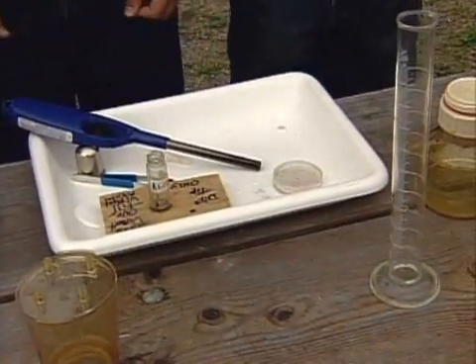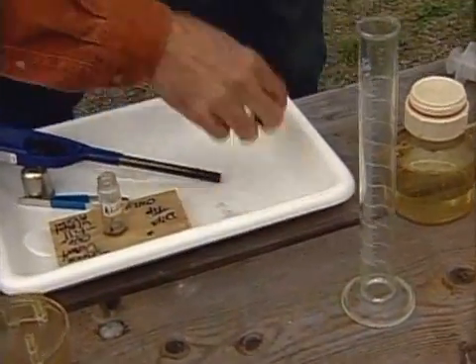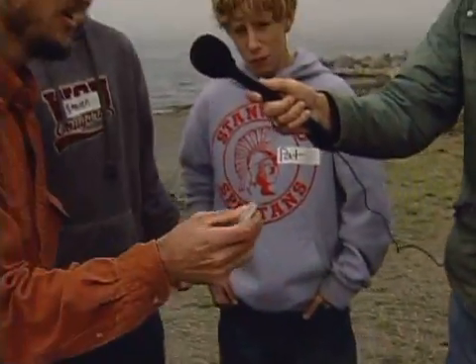There we go. So those bacteria are ready to go. They're on the paper. They've got a nice shelter. They've got food. We're going to stick them in an incubator for 24 hours where they can get warm and grow. And just like any good cooking show, we've done that ahead of time so you guys don't have to wait 24 hours. And we have a tray over here if you want to come and look at it.